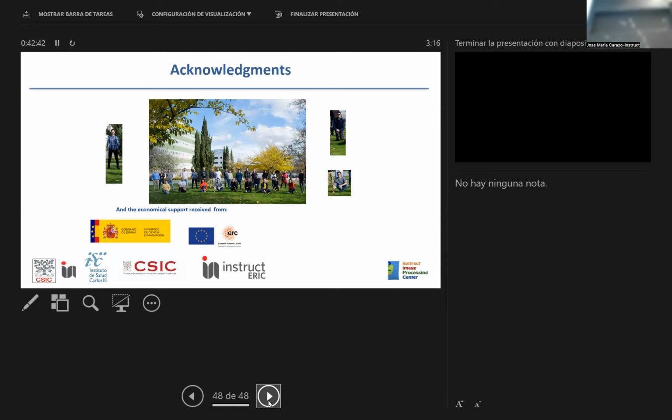I'll start with the end of the talk, I guess, with your ZAP method. Yes, so you need a consensus map, but yes. What kind of resolution does your algorithm work at, and how much flexibility can it deal with?